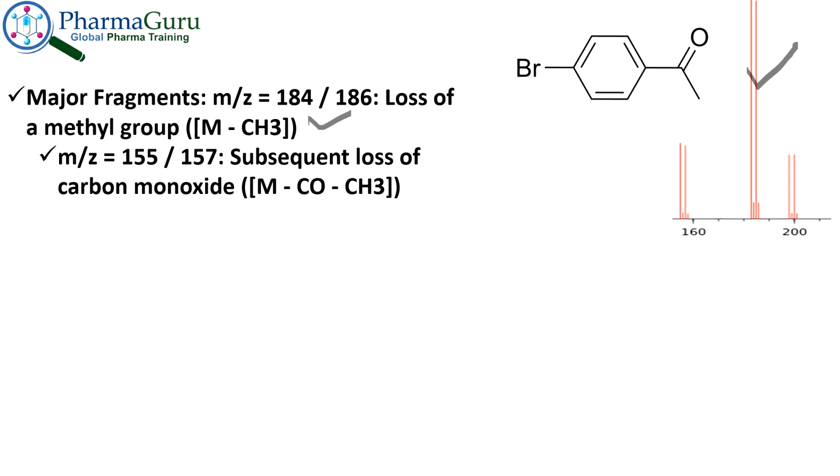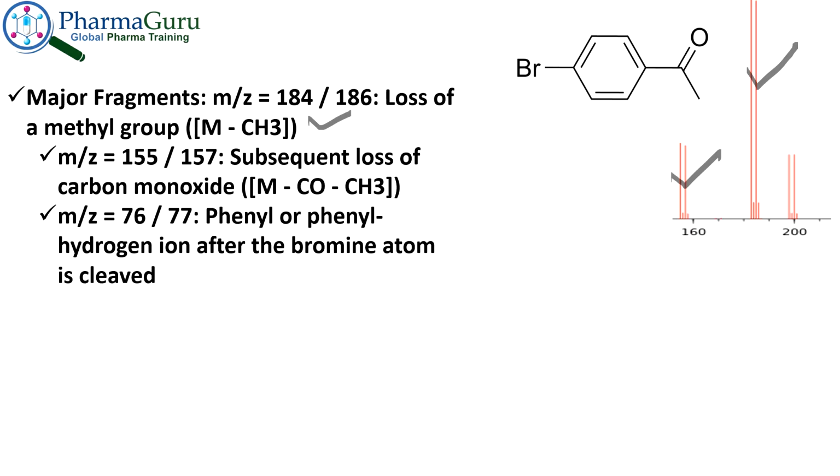The LCMS spectrum also confirms the same. m/z 76 and 77: phenyl or phenyl hydrogen ion after the bromine atom cleavage. The LCMS spectrum also confirms the same.